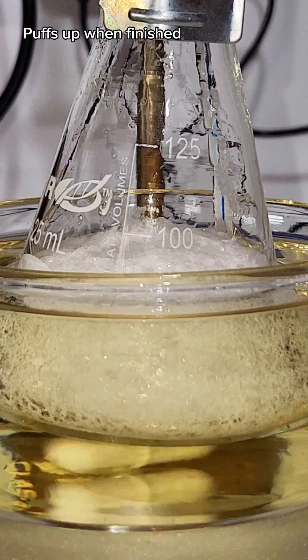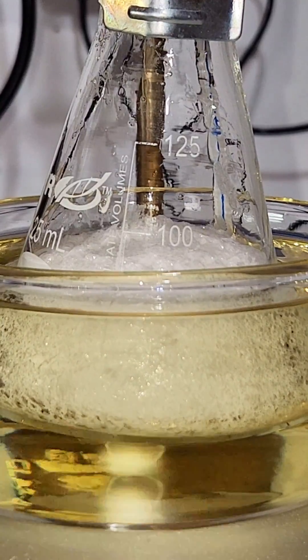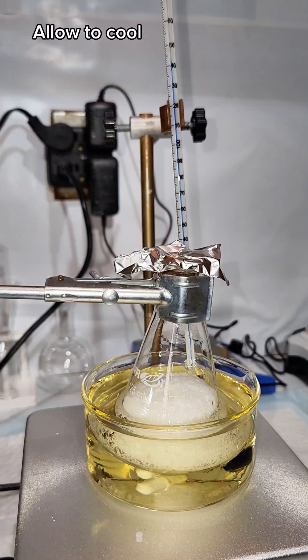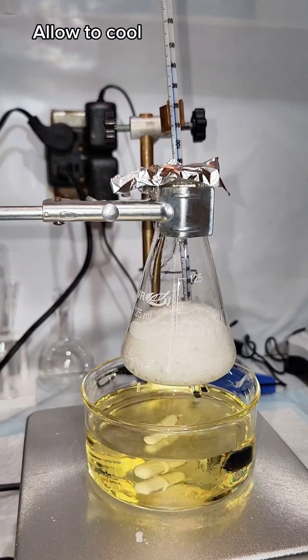The result is pretty much pure phthalimide, which puffs up when it's done. At that point, I remove the Erlenmeyer flask from the oil bath and allow it to cool for a while.